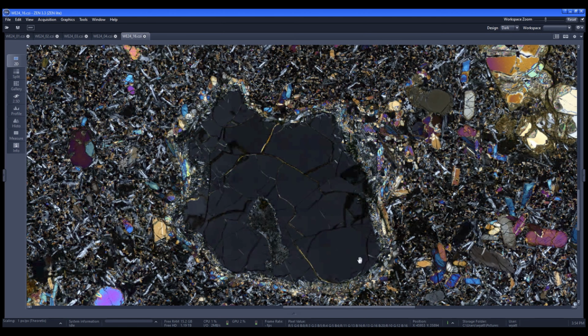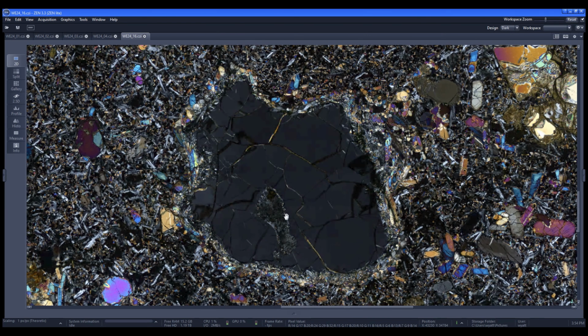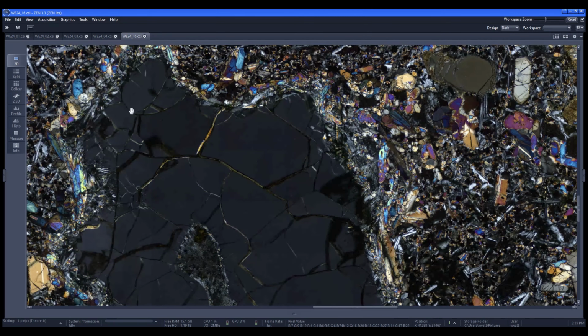Again, this is not good when it comes to my geochemistry because you're adding a rock that didn't really initially start in the magma, but it's really cool to see that in thin section. So this is a xenocrystal that got incorporated in the magma, and the magma started to react with it, and you formed a pyroxene rim around that quartz grain.